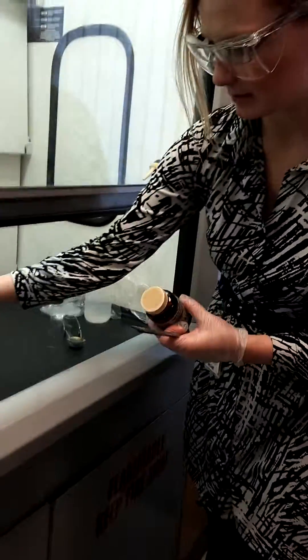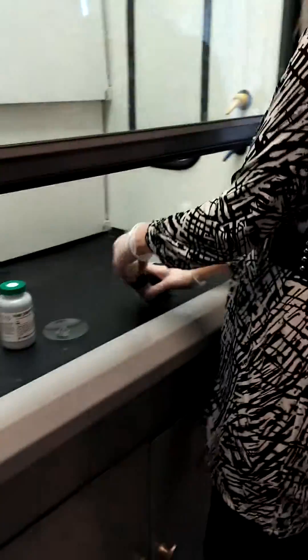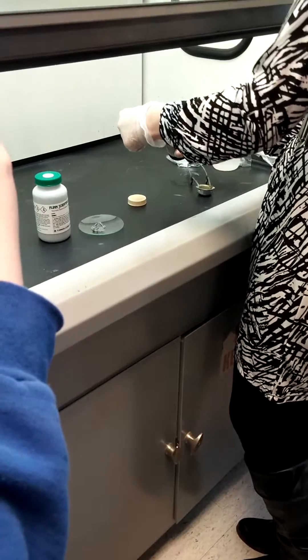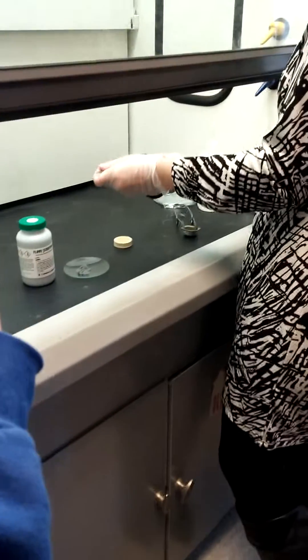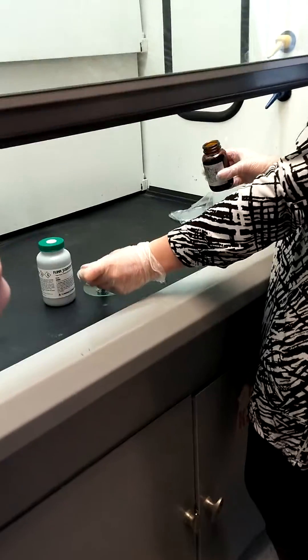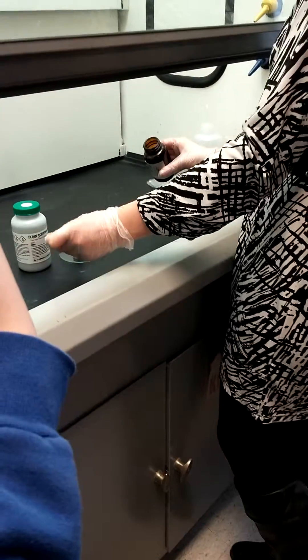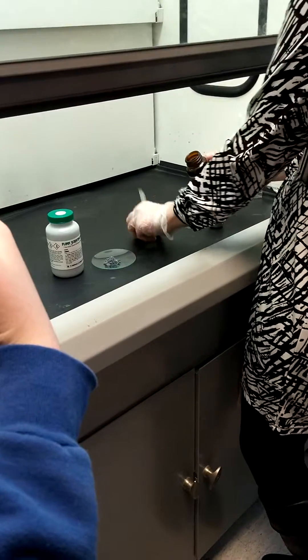And then, this is iodine. I'll let you take a picture in just a minute, so don't let me forget. I told you it goes from a state of matter of — so what is this state of matter? Solid. And it's going to go directly to something else. I want to see if you can figure it out. It's not difficult.